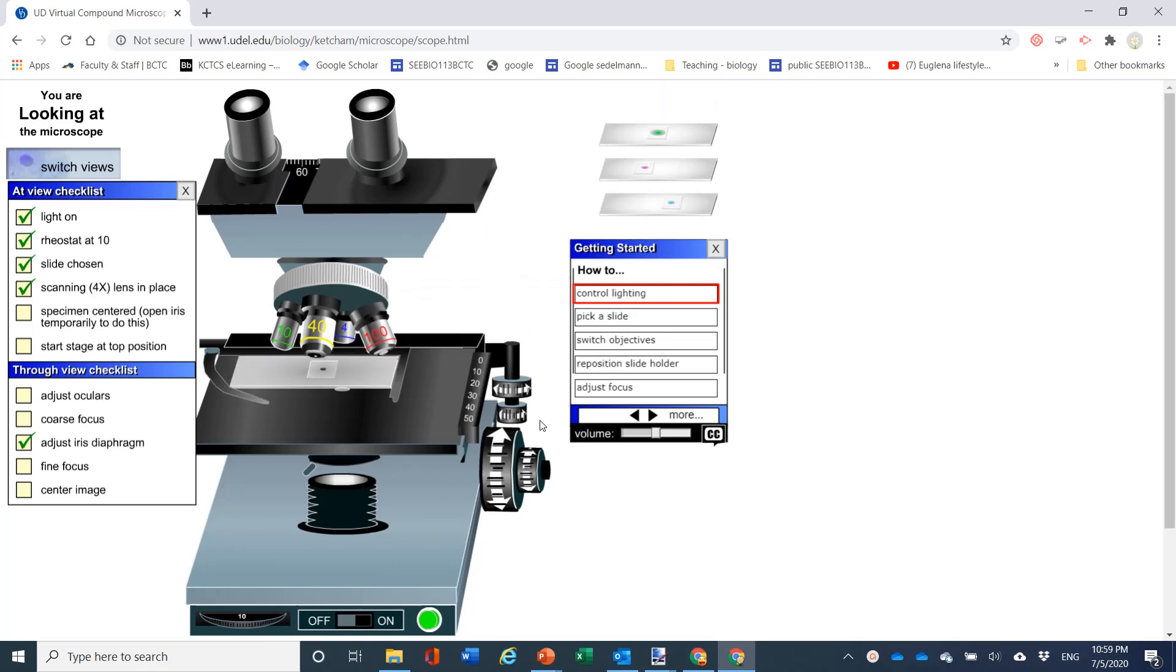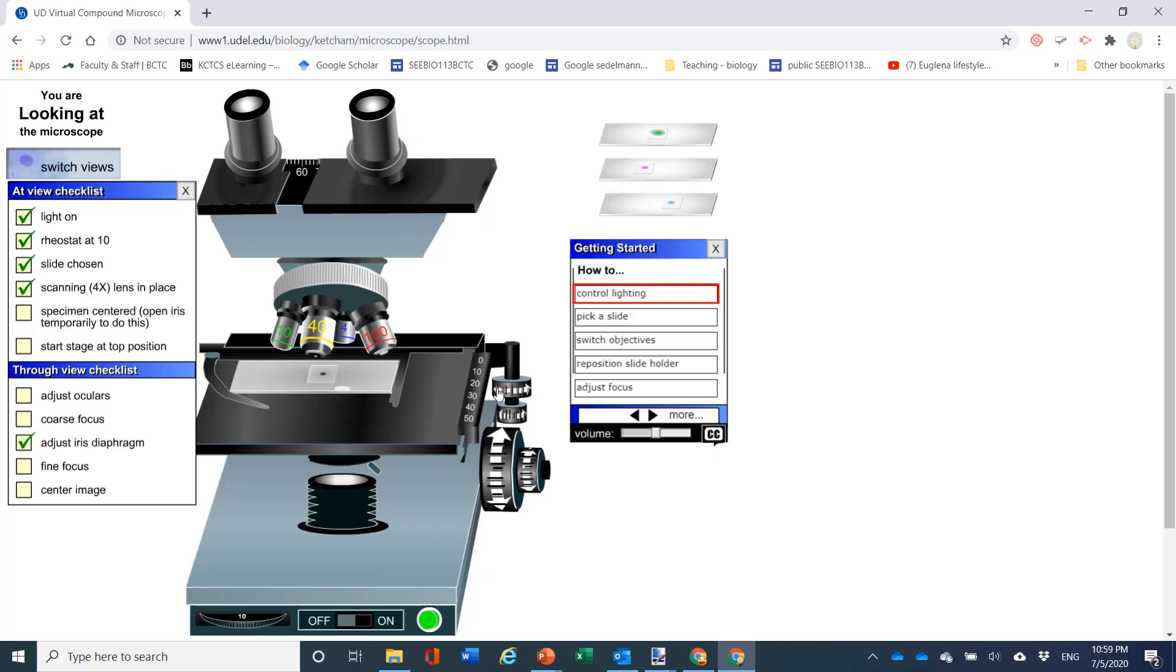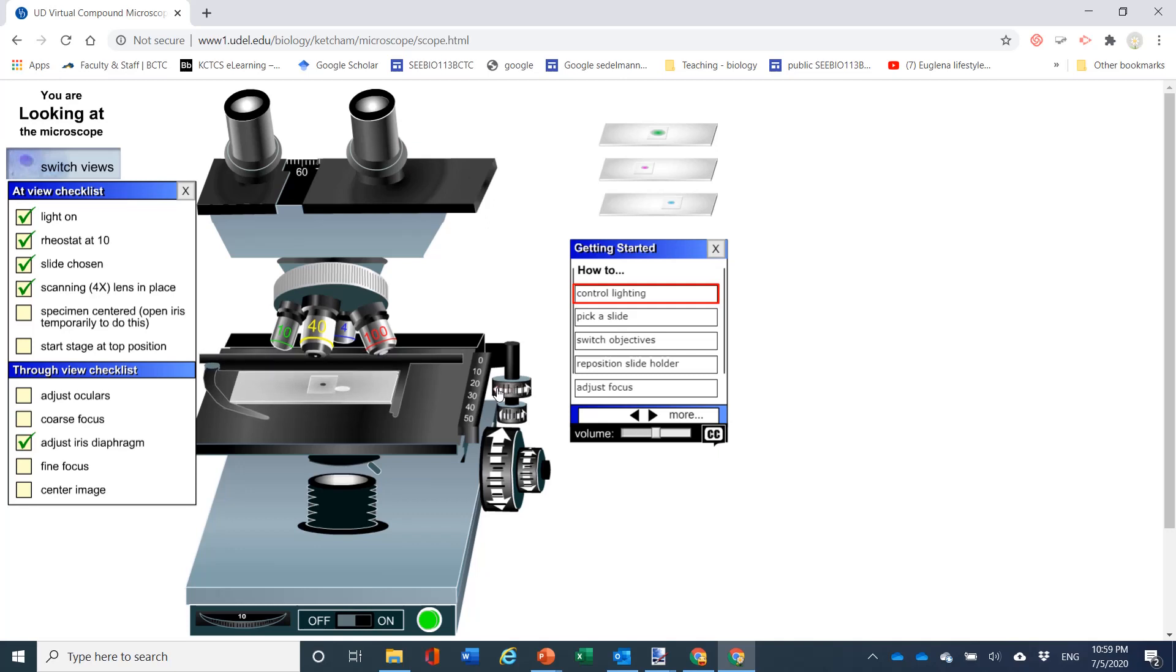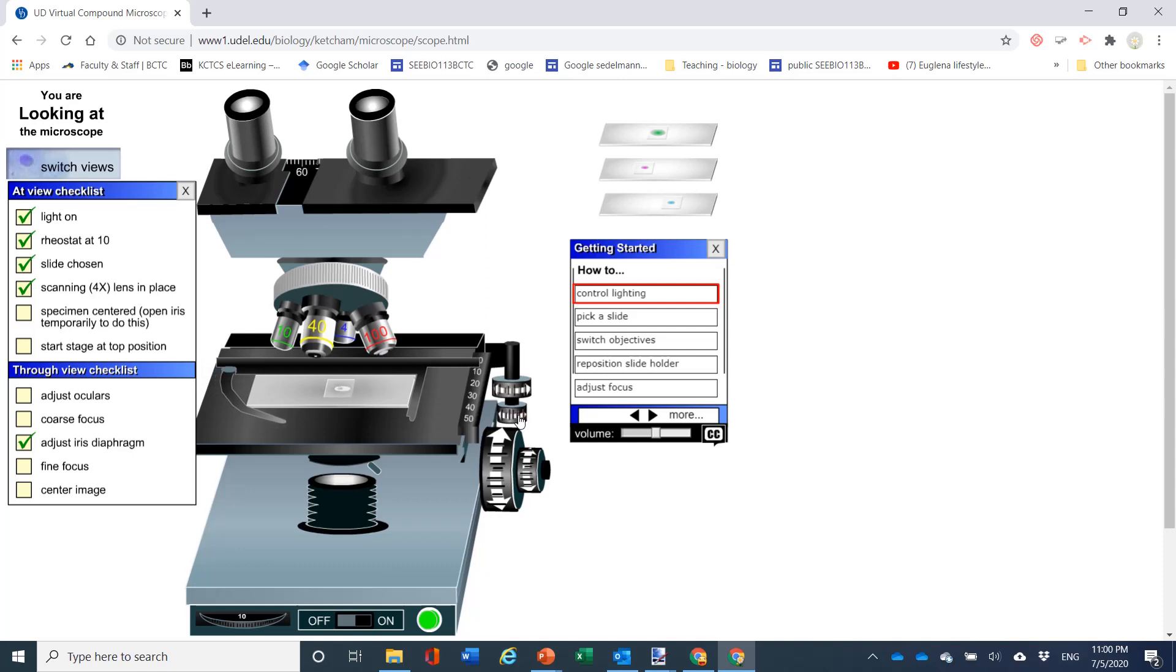Now you want to open the iris so you see the light, and you want to do this in real life too. And then you want to make sure that you center the specimen over top of the light. And you're going to do this before you actually look into the microscope.